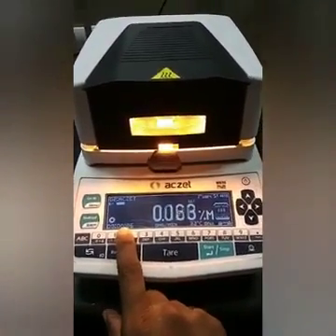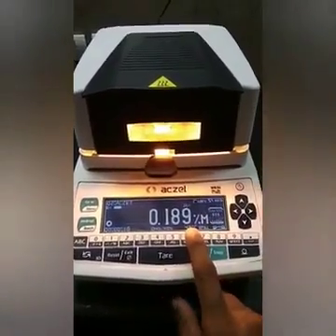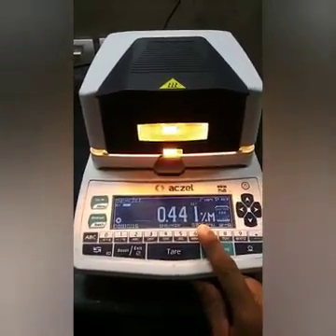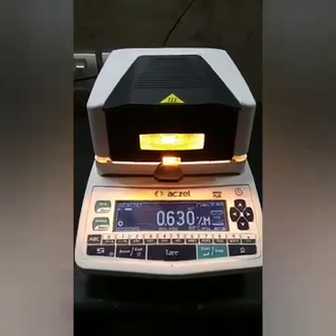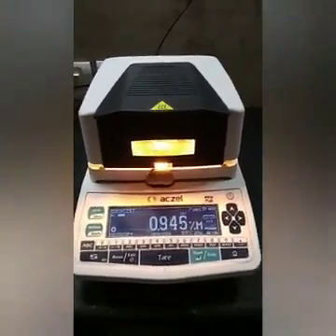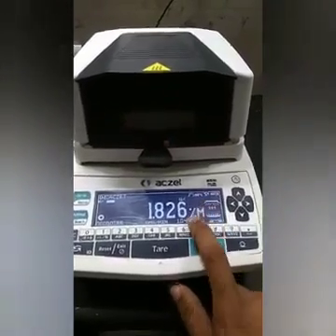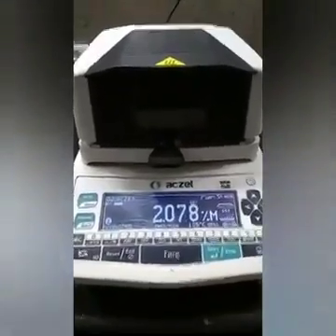You will see the time displayed showing how long it will take. The temperature will increase until it reaches 100 or 110 degrees. At that point the indicator will blink or turn off — so it will take some time.